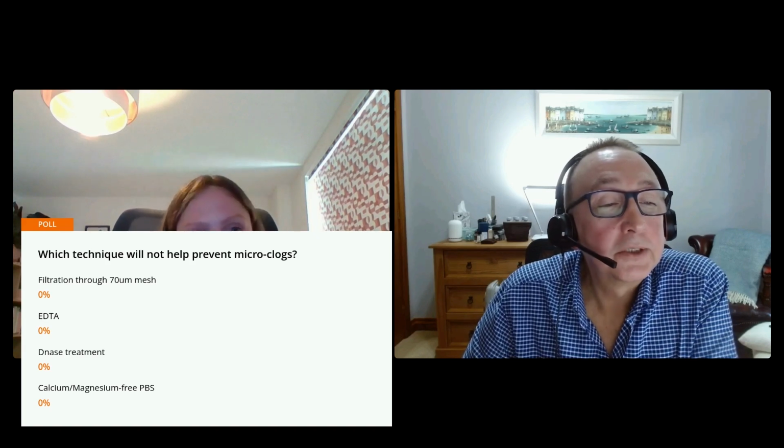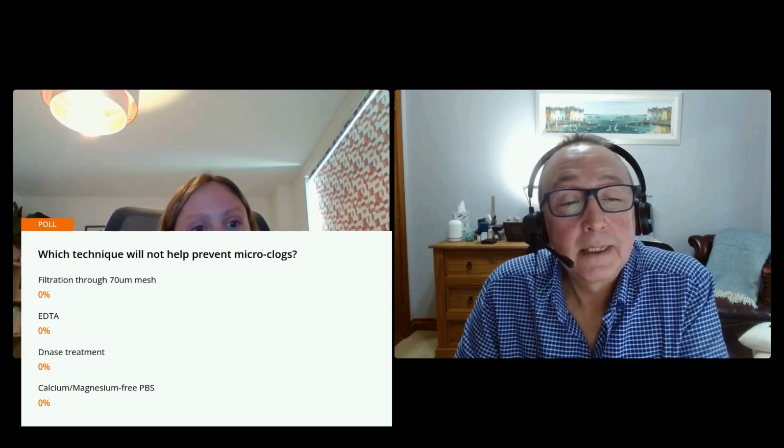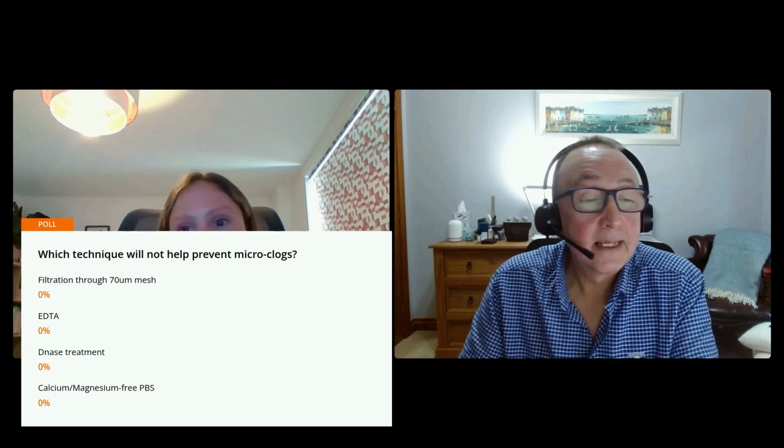Okay, great. And on to the final poll question, and then we'll go to another audience question. Which technique will not help prevent microclogs? Filtration through 70 micron mesh, EDTA DNase treatment, calcium magnesium free PBS.